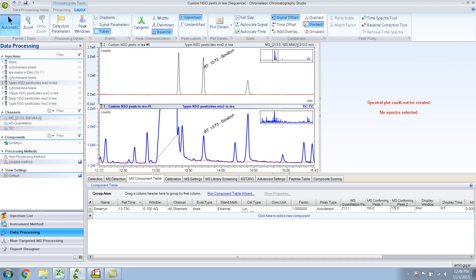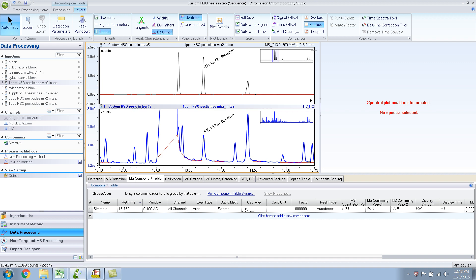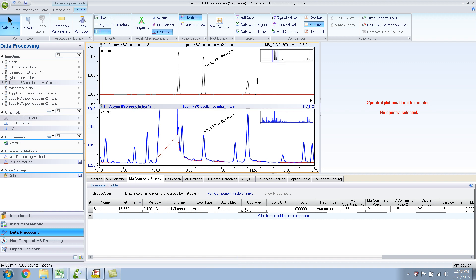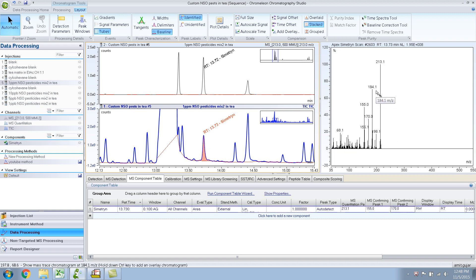Okay, I don't want to do signal offset. So there you have it. The top part of the pane is extracted ion for 213. Let me go back to the TIC so that I have the mass spectra, and let me extract 184 also.